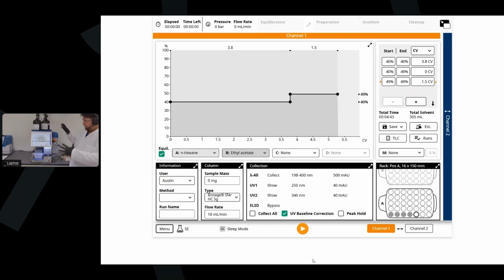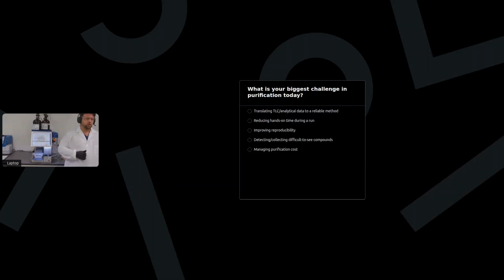So with our hardware overview, I do want to open it up to you guys to help tailor today's talk with our first poll question. I am curious what you are most interested in learning from today. So I'll turn it over to Simone for that first poll question. Our first poll question today is, what is your biggest challenge in purification today?